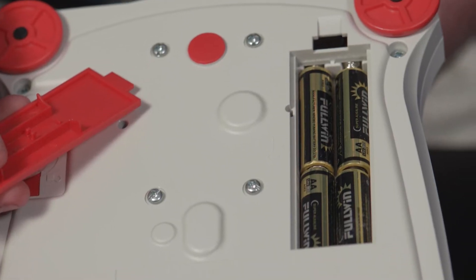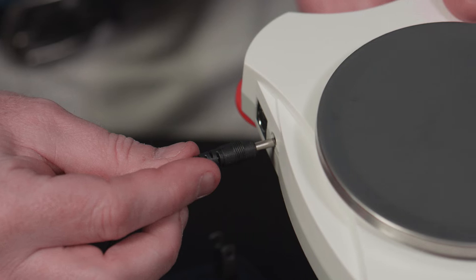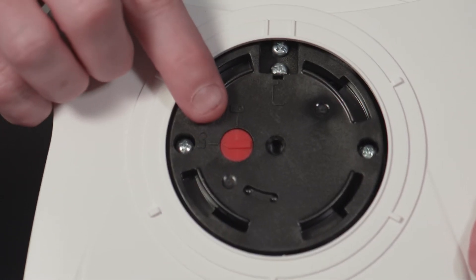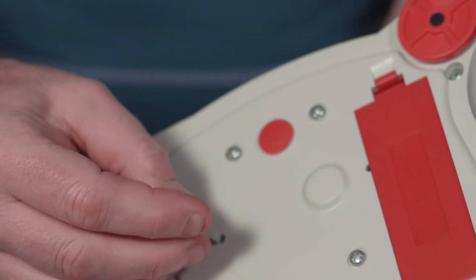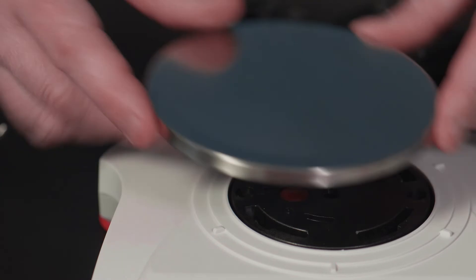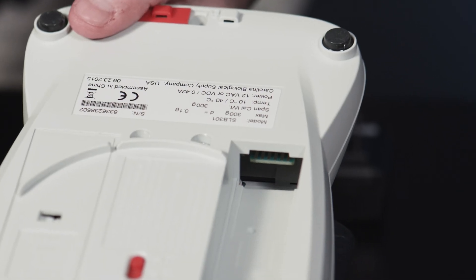Both models can be powered by batteries or with an AC adapter. Both models feature overload protection, travel locks, and weigh-below hooks. Both models are stackable, have a stainless steel pan, and feature an RS-232 interface.